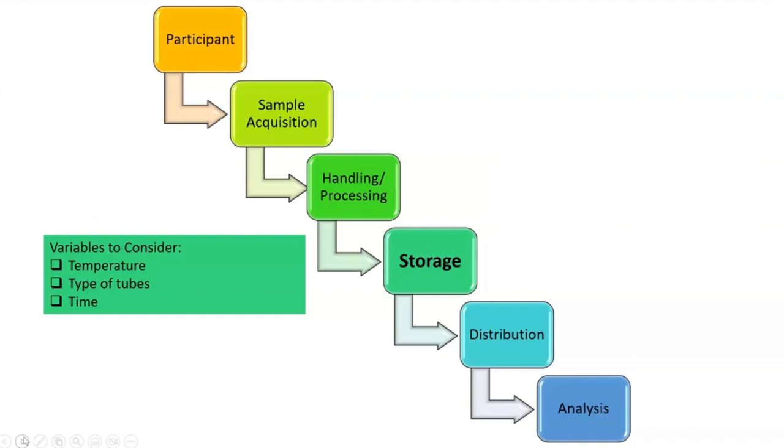Also, remember too, with microbiome research we will often receive a tube that we're collecting the sample in. It may be in some instances that that tube itself can be stored in the freezer for any number of days, years, months. But some of them will require, after maybe 6 months, to be aliquoted into another type of tube. It just doesn't store very long in the freezer that way. So you need to kind of take that into consideration as well.